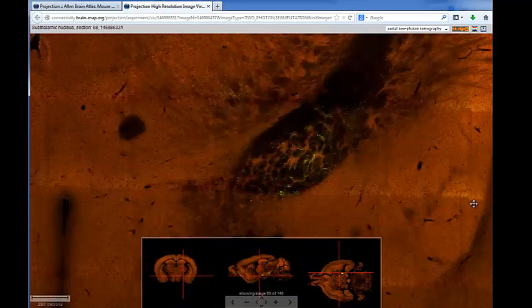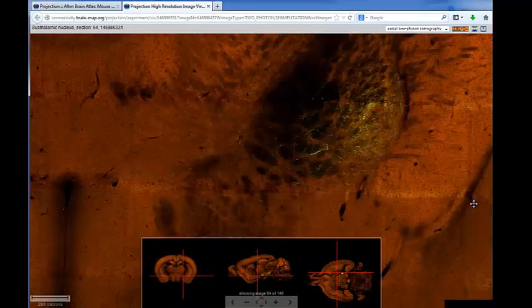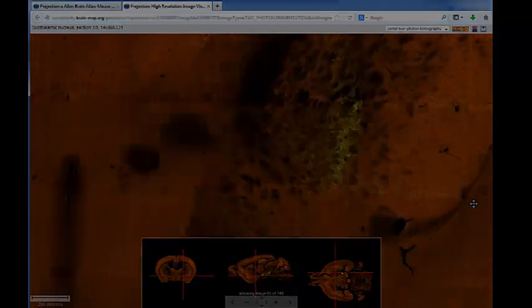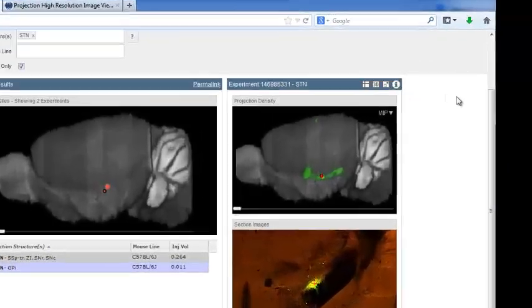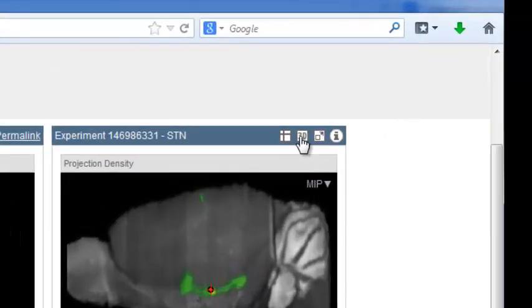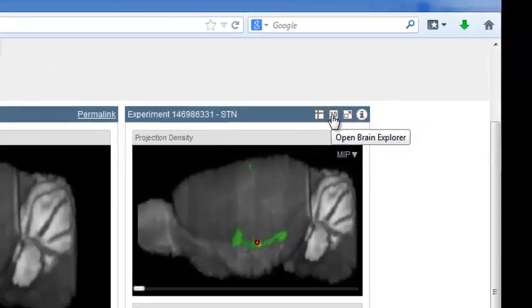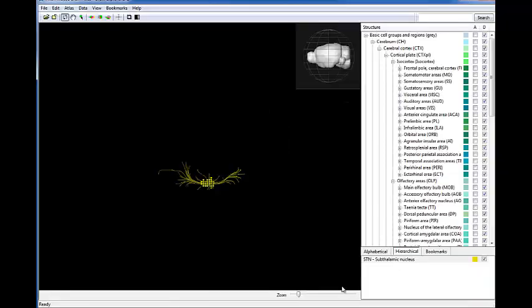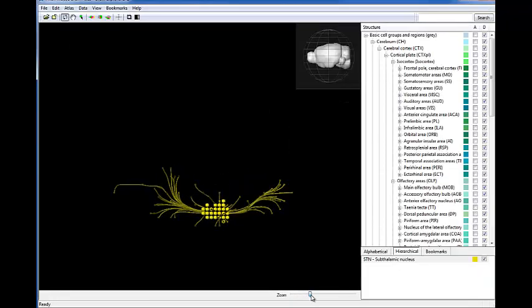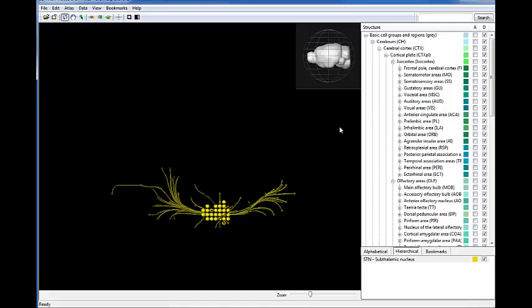As well as viewing the two-dimensional images of each experiment, you can view a representation of this experiment in three dimensions. Click on the 3D icon above the rotating thumbnail view to launch the Brain Explorer software.